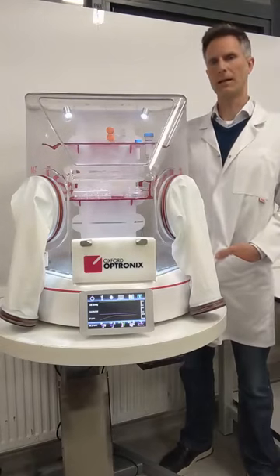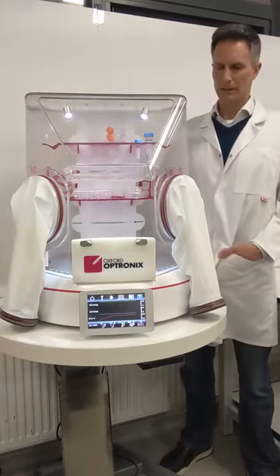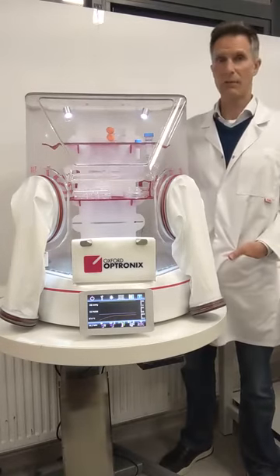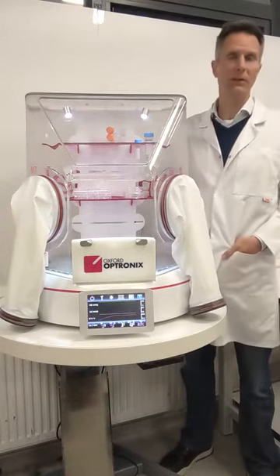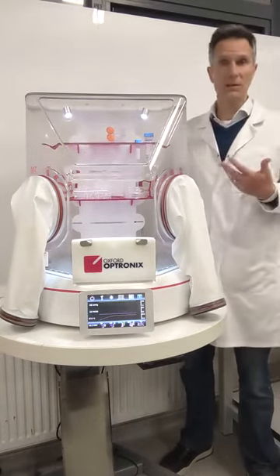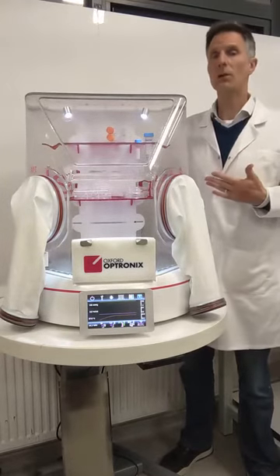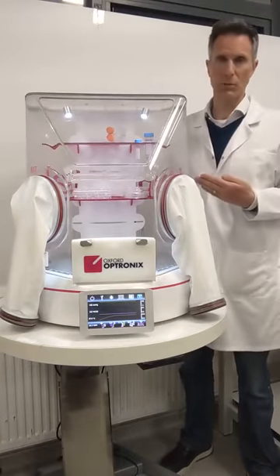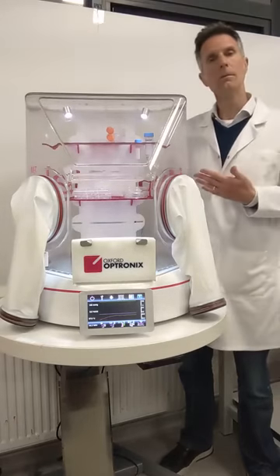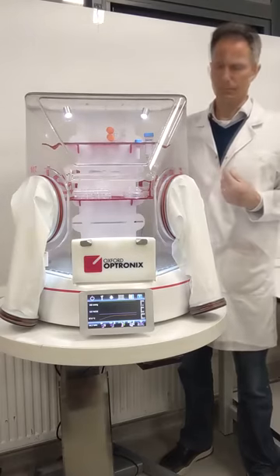My name is Michael and I'm going to be talking to you today about our HypoxyLab system. The HypoxyLab is a hypoxic workstation, which is to say effectively an incubator for cells in cell culture, capable of controlling the usual conditions, which is to say temperature, CO2, humidity, but crucially also the oxygen concentration within its environment, to ensure that cells in culture in this system are maintained under physiologically relevant oxygen levels.